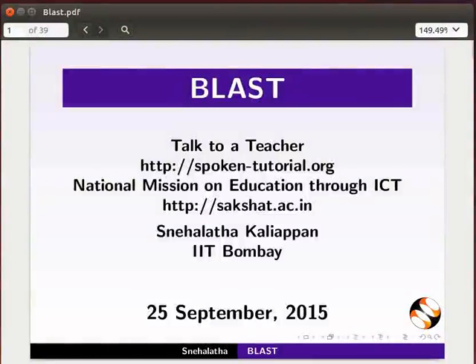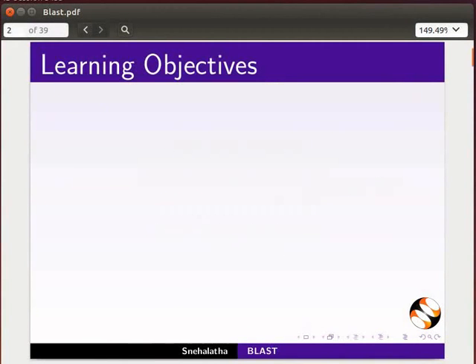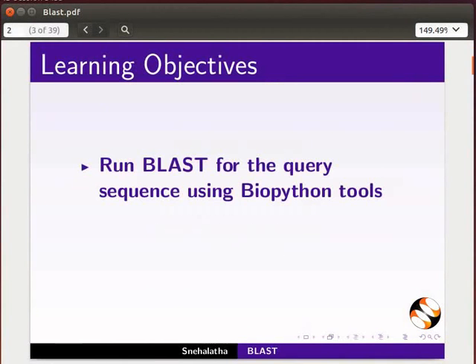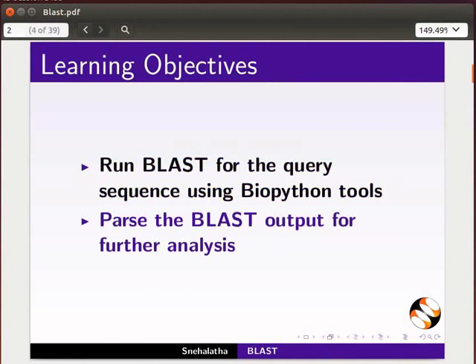Welcome to this tutorial on BLAST using Biopython tools. In this tutorial, we will learn to run BLAST for the query sequence using Biopython tools and parse the BLAST output for further analysis.